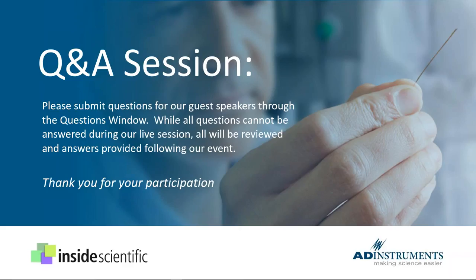Okay, great. Let's switch gears to talking about the saline injection. So, Jim, you did mention there is some potential risk or effect of doing too many injections. Sarah has asked, should a saline injection be done at the beginning of an experiment or at the end? And also, how might this change if someone is making measurements from the LV versus the right ventricle? Is the strategy that you presented slightly different if someone's doing RV PV loops? It should be identical. It's a little more challenging on the right side because of the shape of the loops, but the theoretical concept is the same.